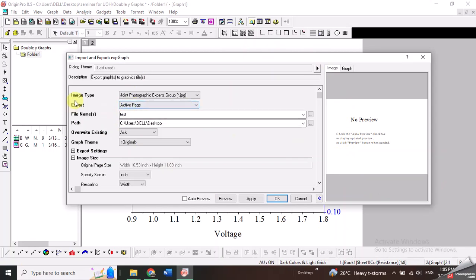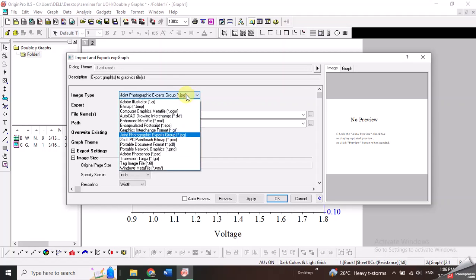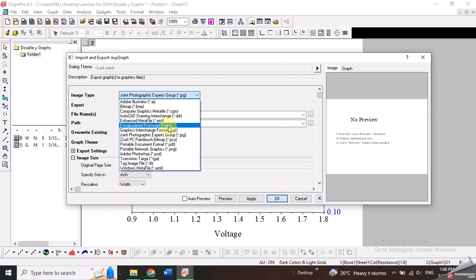You need to make sure first of all that the image type is selected correctly. It should be JPG or some other image format with the proper extension. For example, sometimes if you are using the export page option for the first time then it might be that EPS extension is selected here which is not an image format.